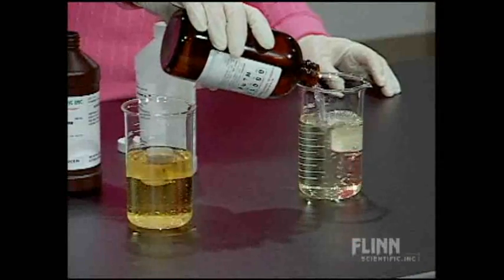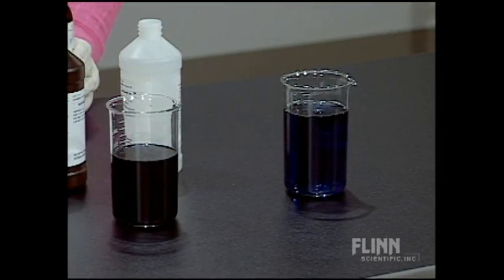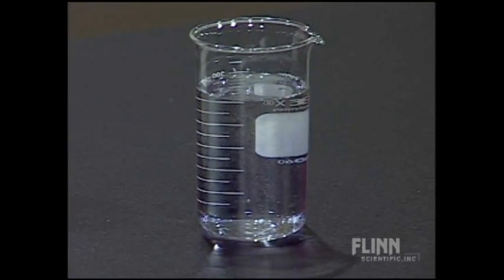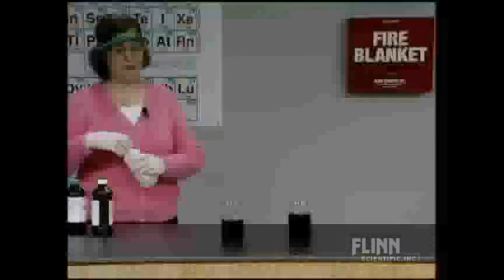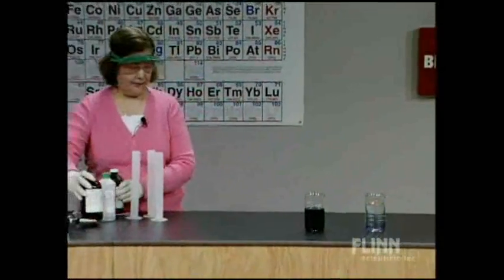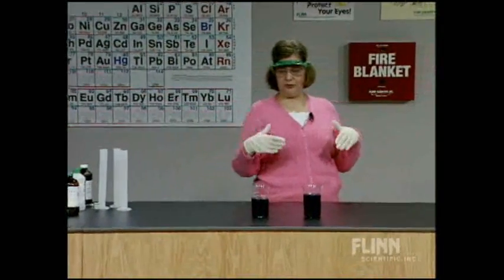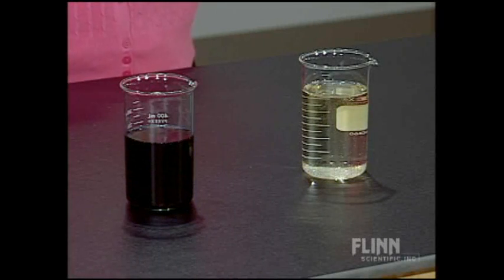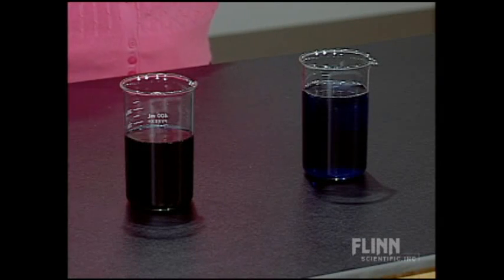And remember, upon adding that third reactant, it immediately turned yellow, then it turns blue. We can watch that one and see if it goes in sync or out of sync with the first one. It's gone. They're going to compete here a little bit, I think. Yellow, blue, call that the yellow-blue switcheroo. I want to talk about the chemistry a little bit. It's a fun reaction to watch. Students always ask, well, how long will that go on, that yellow-blue switching? This one, you can see, is bubbling a lot now. It starts getting quite a bit darker. Almost gets a little bit of a metallic-looking color to it. There is some iodine that's produced in that chemical reaction.